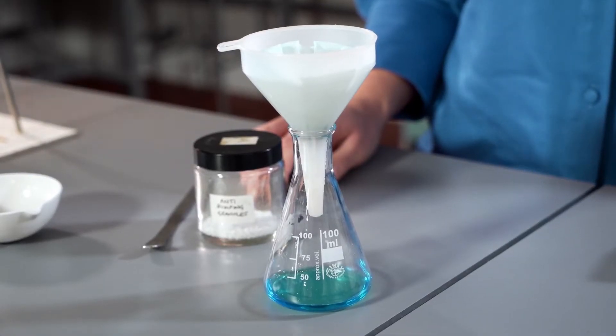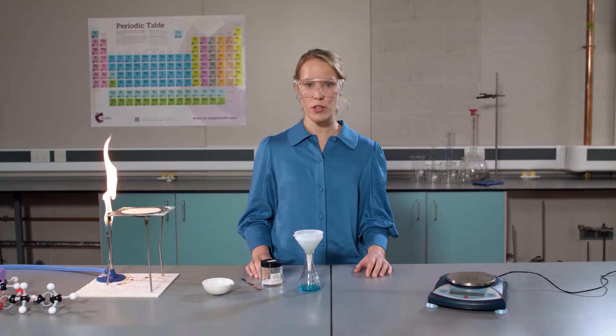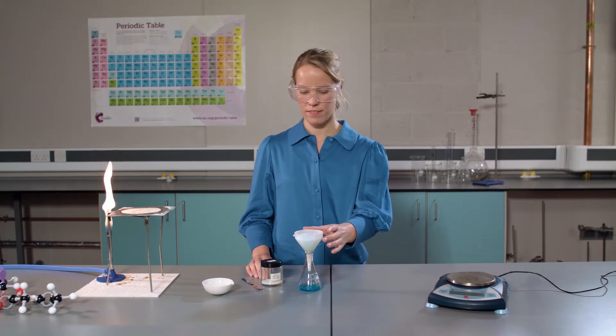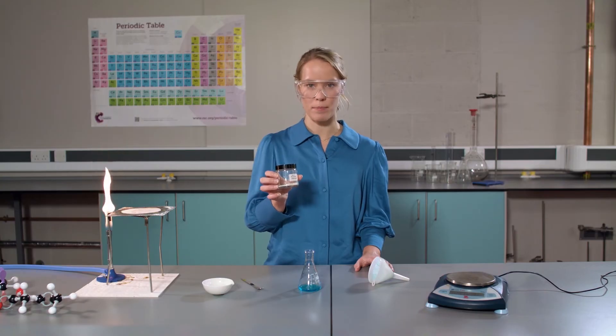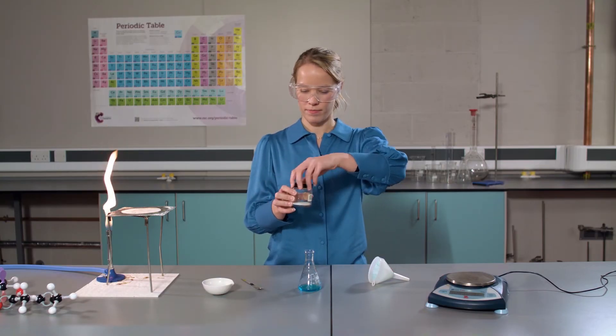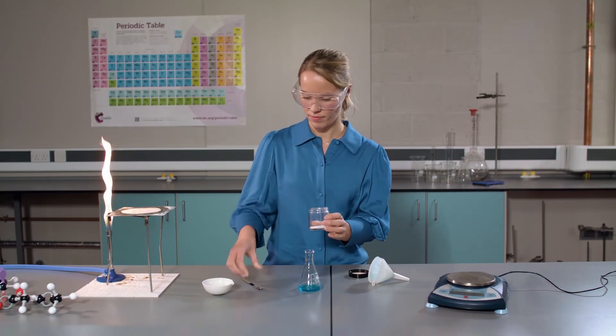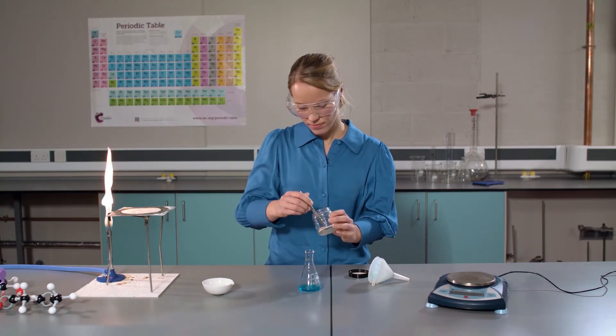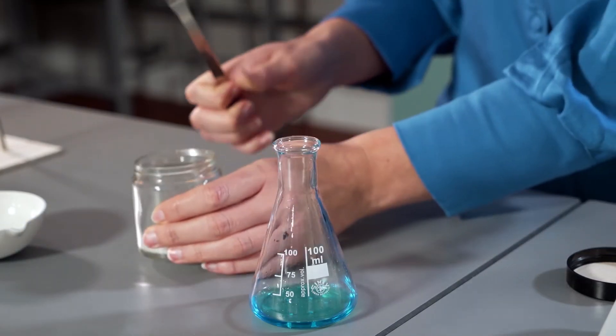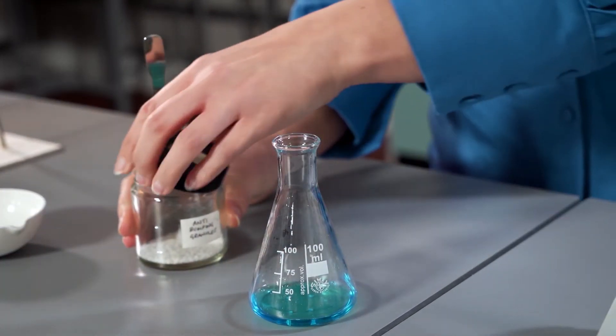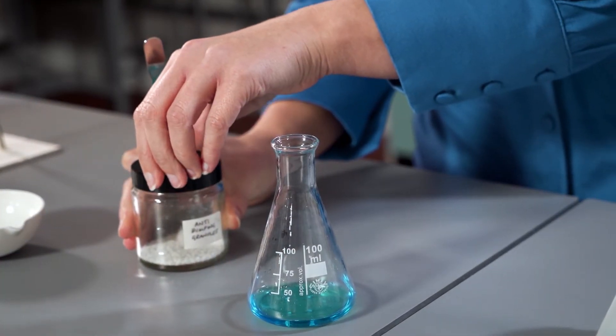Now we need to remove excess water by evaporation to make a concentrated solution of copper sulfate. Before we start, I need to add two to three anti-bumping granules. These will help maintain a smooth boiling action but do not react with any of the particles in the flask.